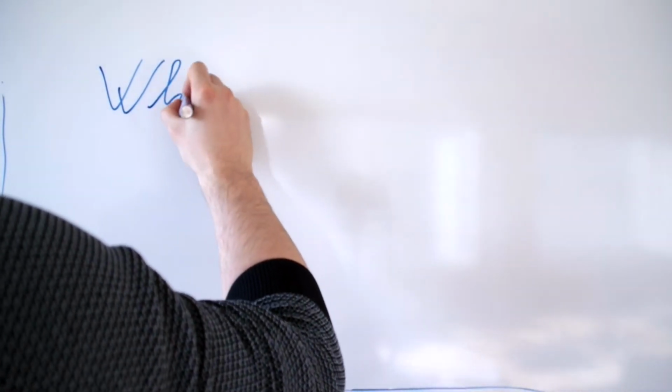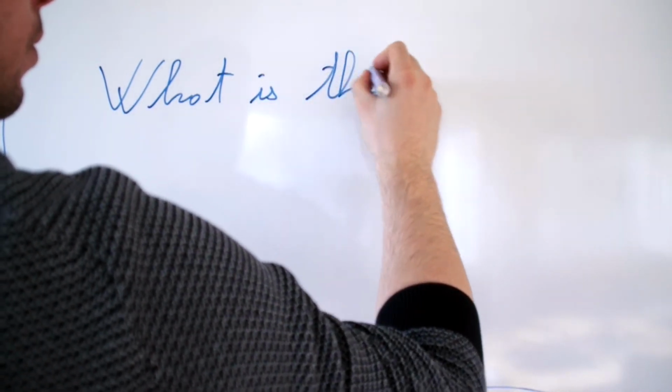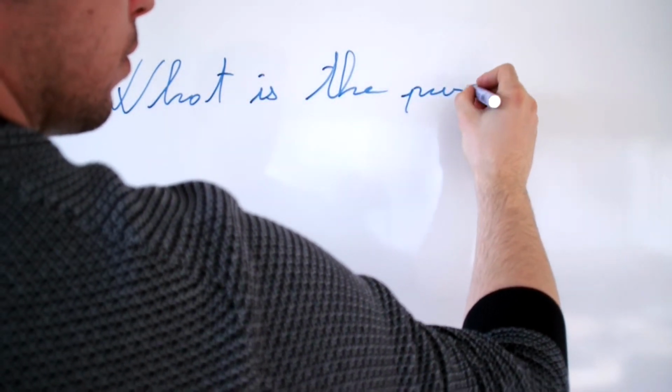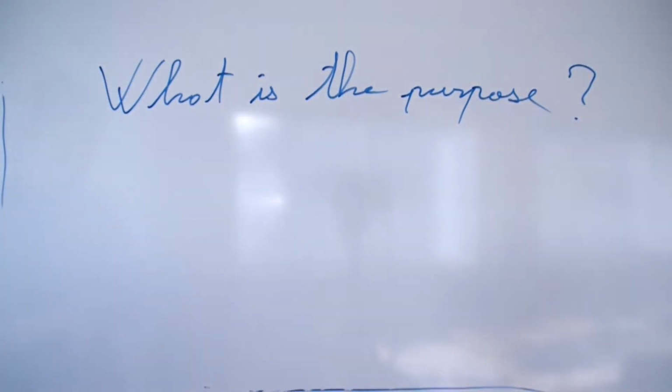These kinds of experiments give you more insight on the genes involved in the disease you are studying and the importance of some proteins in this disease. For example, the Enlighten project is interested in the importance of some specific proteins in autoimmune diseases, like diabetes.